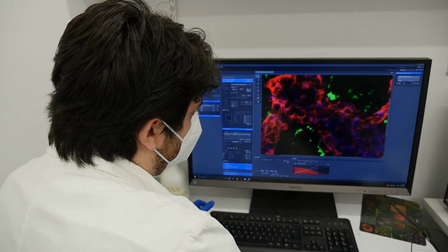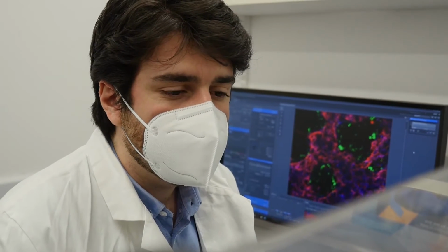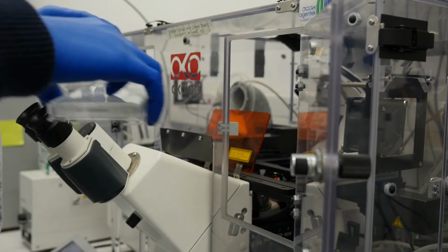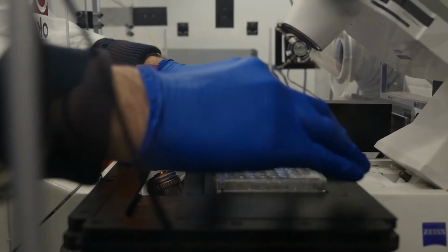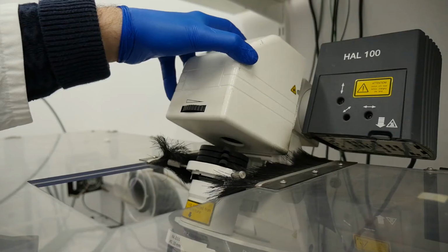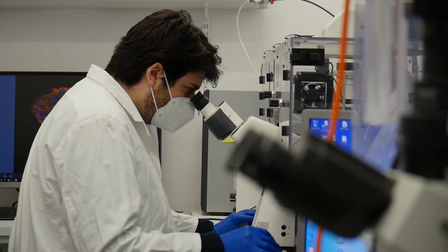What we found is that cisplatin prevents the kidney cells from releasing the glucose they reabsorb. Essentially, it causes this massive accumulation of sugar in the kidneys, and we can see that on the chip. And our technology allows us to see that this glucose causes the cells to start synthesizing fat, accumulating fat, that is simply not supposed to be there in the human kidney. And that fat causes the damage that we see.